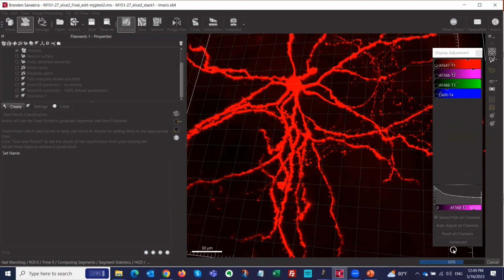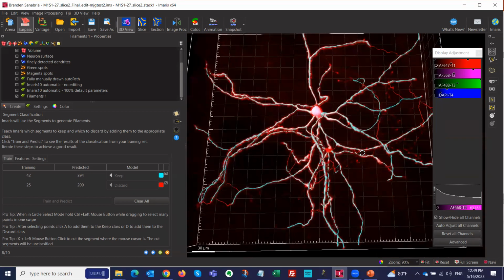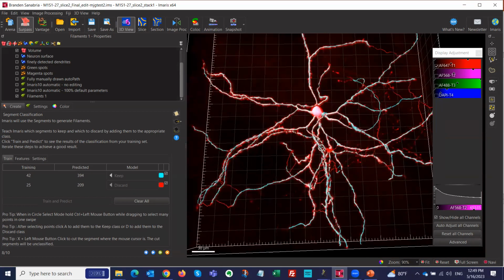Okay, I'll just give it a few more seconds. Okay, and it's already done, so definitely much faster. And I can already hear my fan, so it's working. But it's much faster. Okay, so this is the second machine learning step. Step 8 out of 10. So we're almost done, almost there.